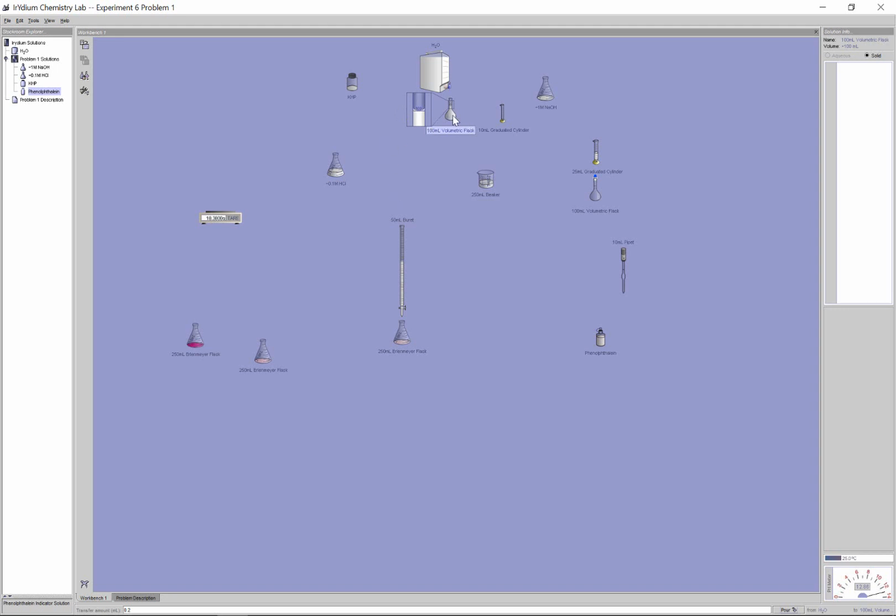So we're going to take our diluted solution here. You should label all these ones here. Let me just clean up a little bit here. So I have my diluted NaOH here. I'm going to use my diluted NaOH here to titrate against HCl. The things that I can remove here, because it's the magic of a virtual lab, you can just highlight them and just press the delete button, and voila, they're gone. So we have our solutions here.